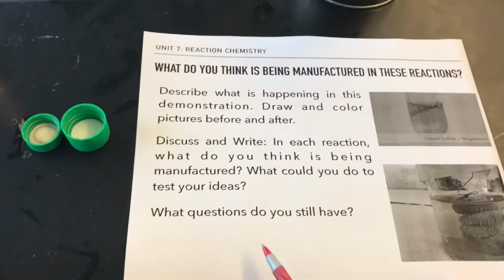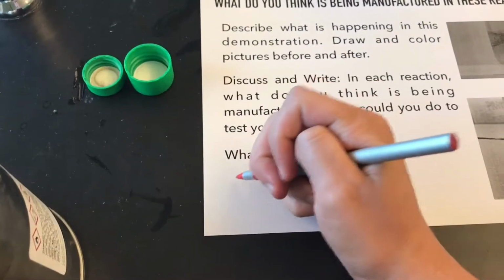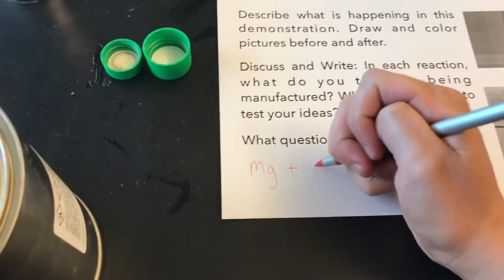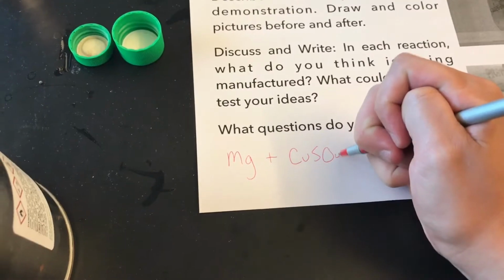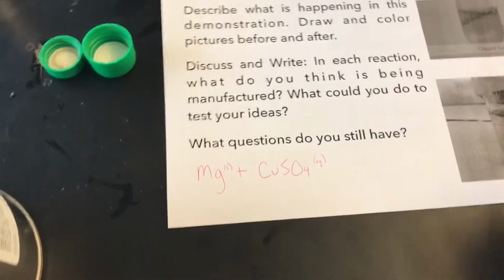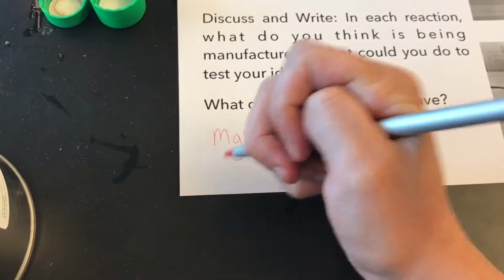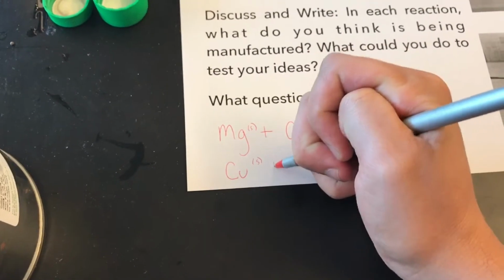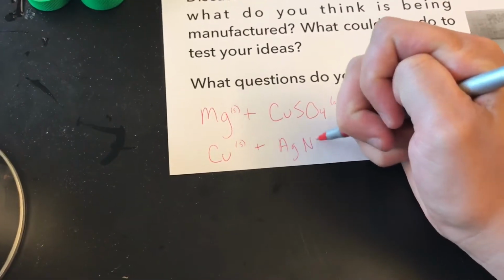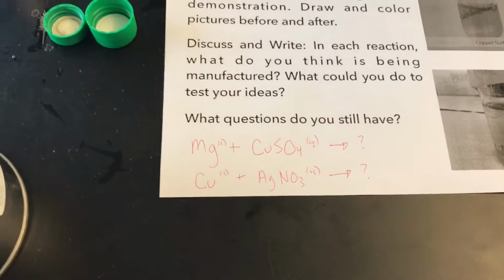So I'm going to write down a little bit at the bottom here of what you're going to be seeing. So the first reaction that you're going to see is some magnesium ribbon, and we're going to be mixing that with copper 2 sulfate. Okay, and the magnesium is a solid, and I have an aqueous solution of copper 2 sulfate. And so the question is, what do you think is being manufactured? In the second one, I have a piece of copper. It's also a kind of wire-looking thing. And we're going to be mixing it with silver nitrate, aqueous solution. And what do you think is being manufactured there?